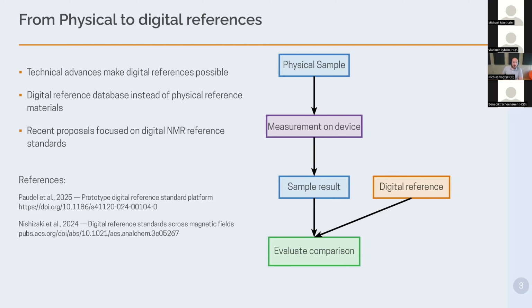But for low risk processes, this is also one of the points where you might be able to use some data you might already have lying around, where you have already measured spectra, and you can, for at least some purposes, construct your own digital reference from them. All right, so that's in broad strokes what references are for. And this is pretty much independent from what kind of measurement device you're using.